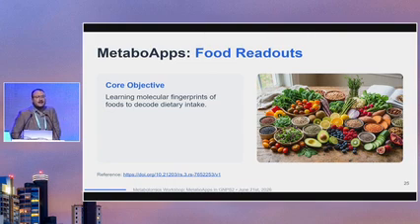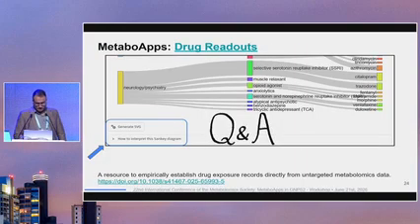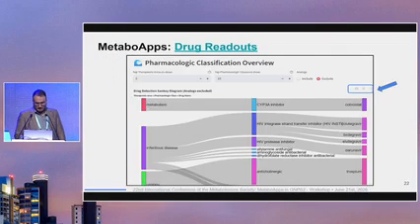Question? A very quick question. Yeah, sure. In the last thing that you showed, there is something called analogs excluded in the diagram. Yeah, right here. What do you mean by that? What exactly are the analogs?